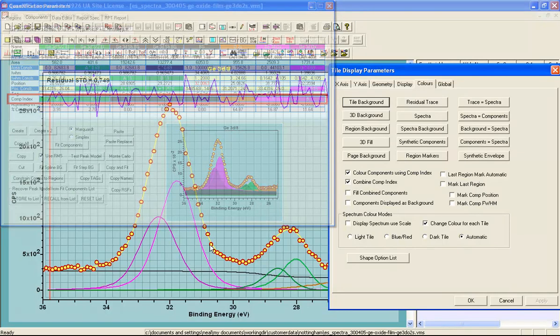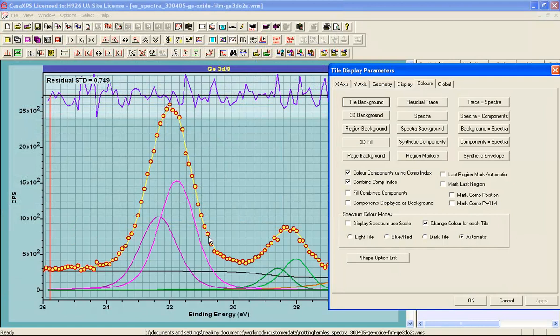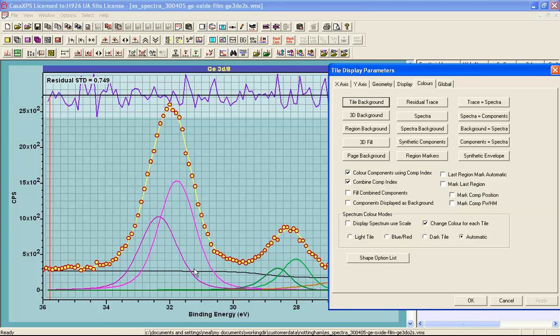So if the export is now performed with the display in this form, we will obtain a different set of information that will include the sum of these components that are representative of the background.